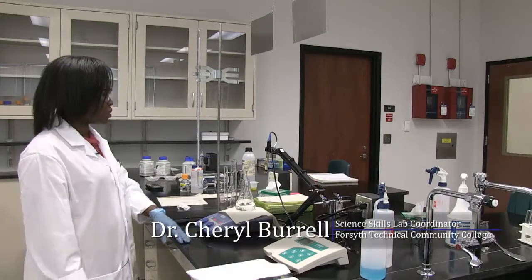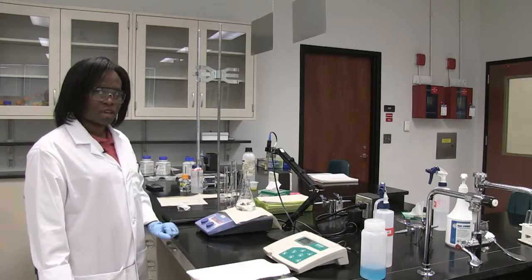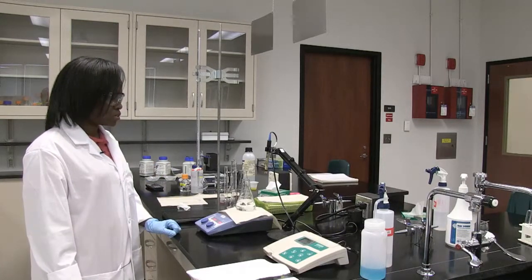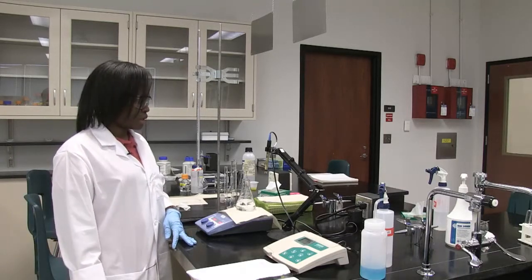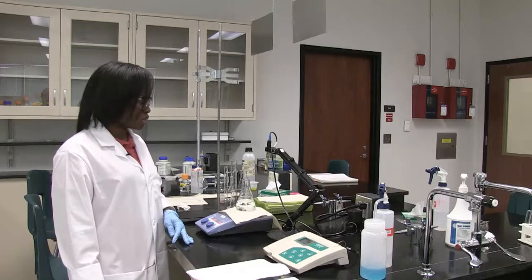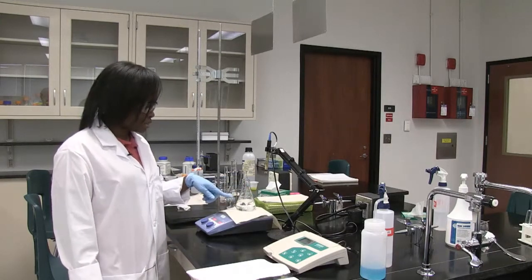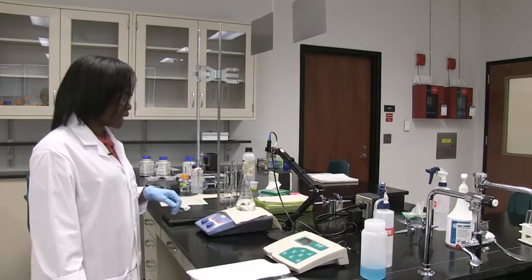We're going to titrate our buffer solution with our base, which is sodium hydroxide — a strong base. After making the acetate buffer solution, I put 125 mL of it into a 250 mL Erlenmeyer flask.